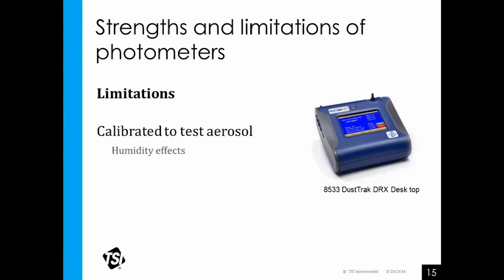It's a lot heavier than a dry sponge. And aerosol, as it grows and absorbs moisture, is going to grow in size and swell. The instrument's going to see that larger particle and assume larger mass. It's going to scatter more light. It's going to read it as a heavier particle. Your readings are going to be elevated slightly over what they probably naturally are if it was not humid.